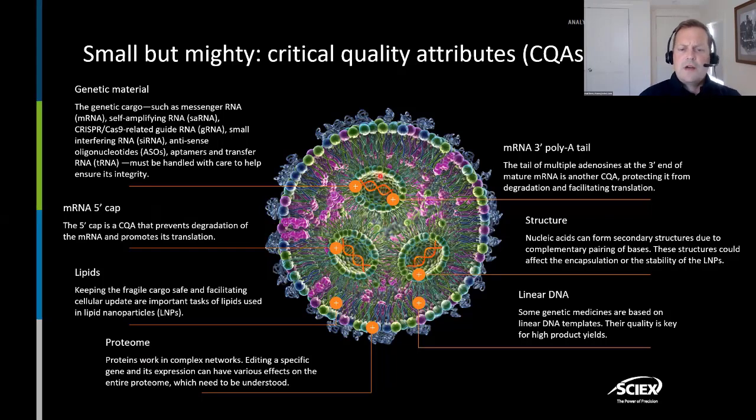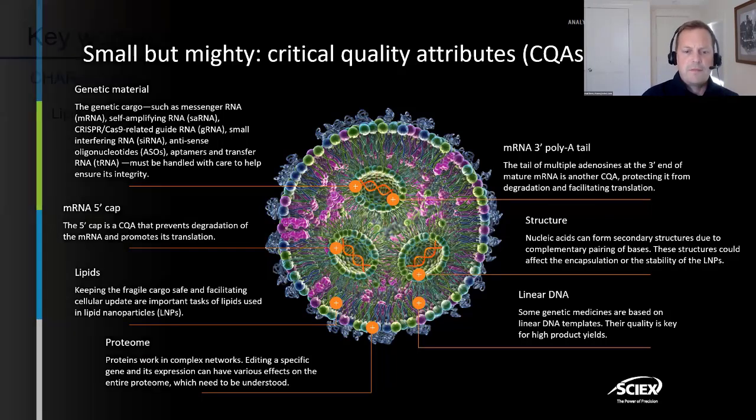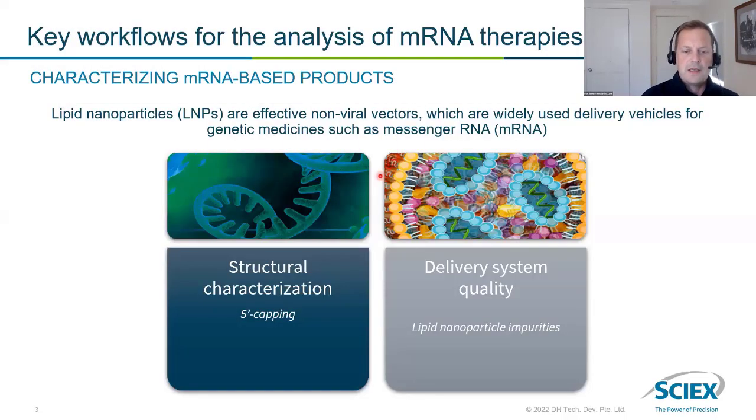Yeah, and in my view, the 5' capping assay is a relatively routine assay. You don't need a necessarily high-end, high-resolution instrument to do it. But what I want to showcase today are some of the tools within the SCIEX OS software to automate and streamline the process to assess the yield of your fully capped species.